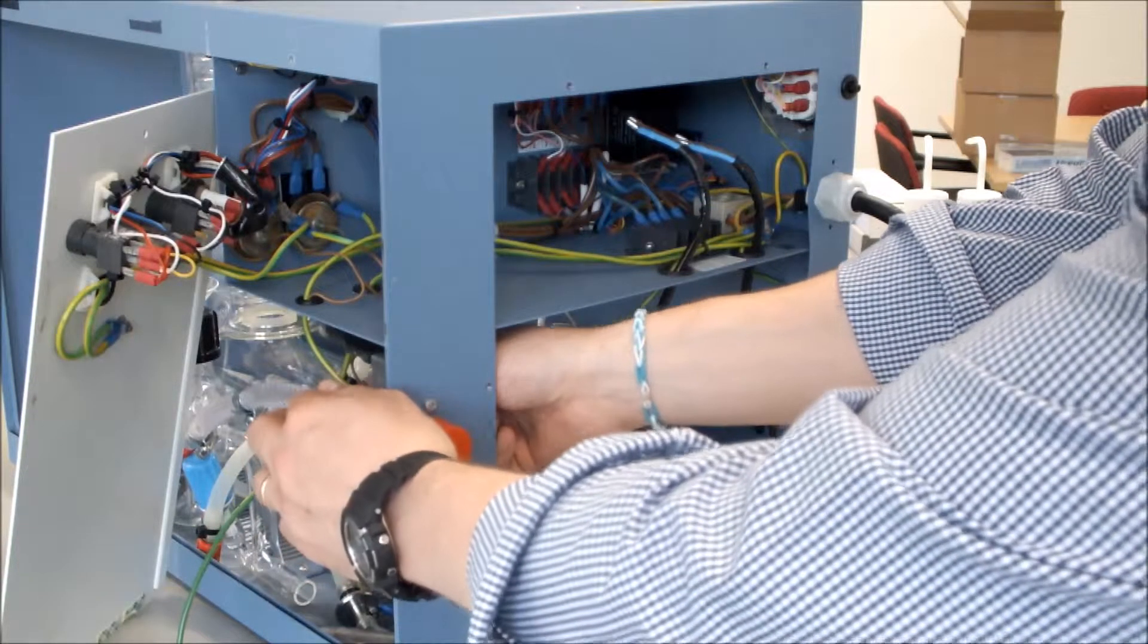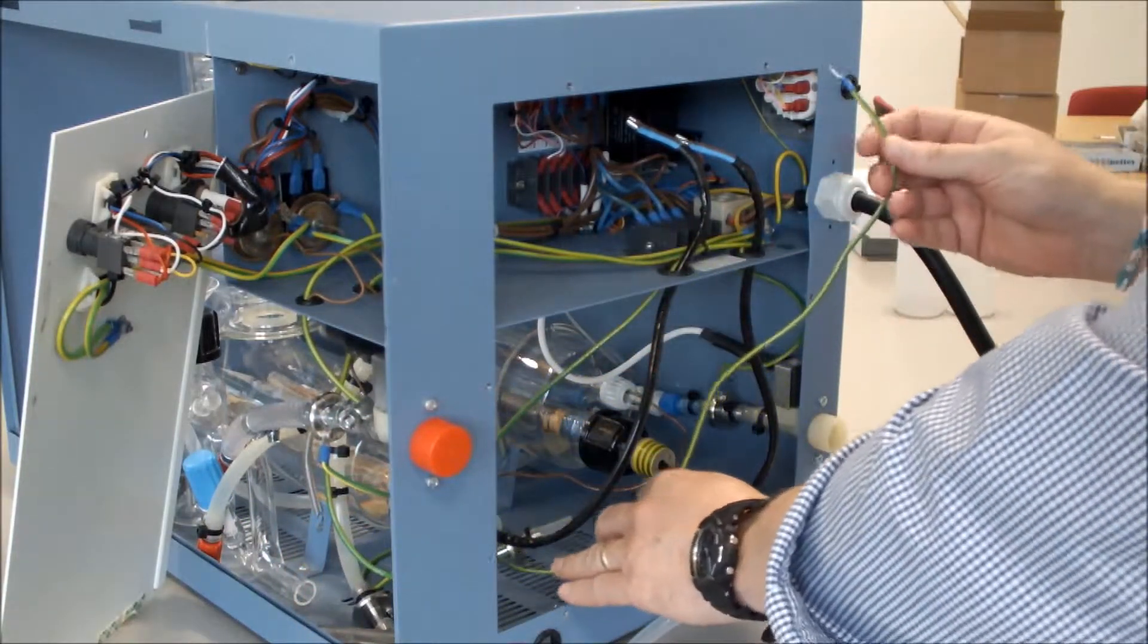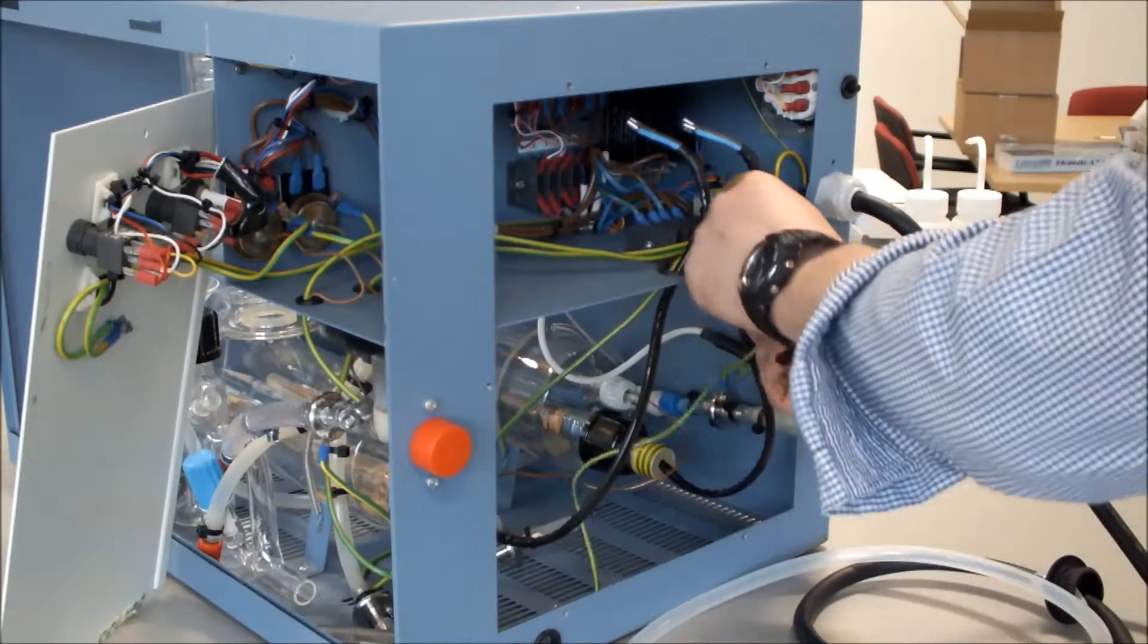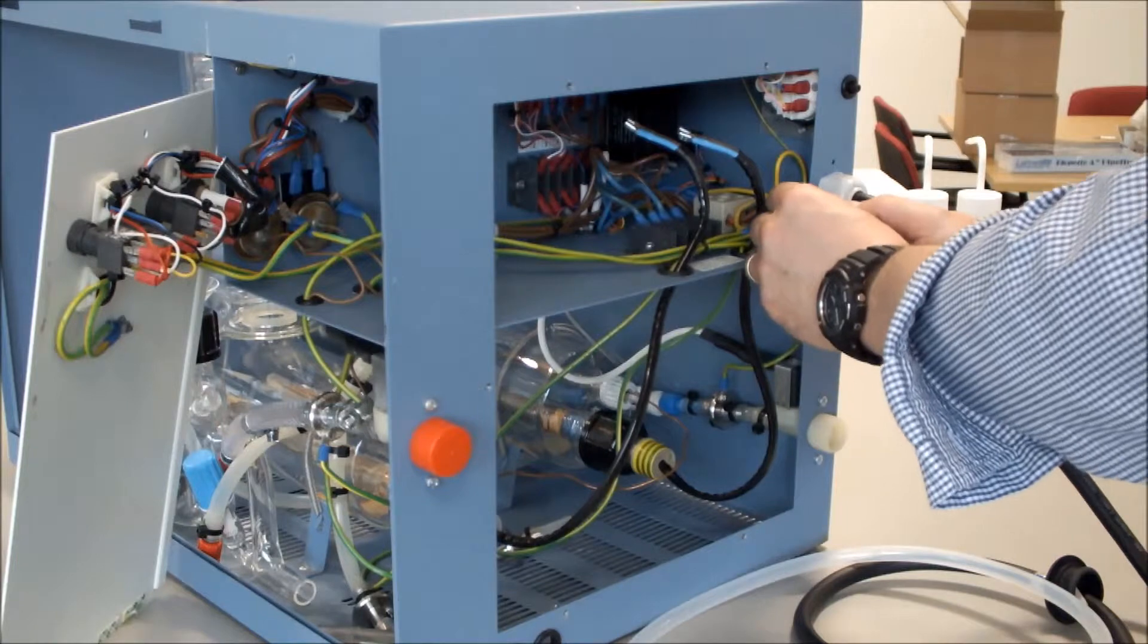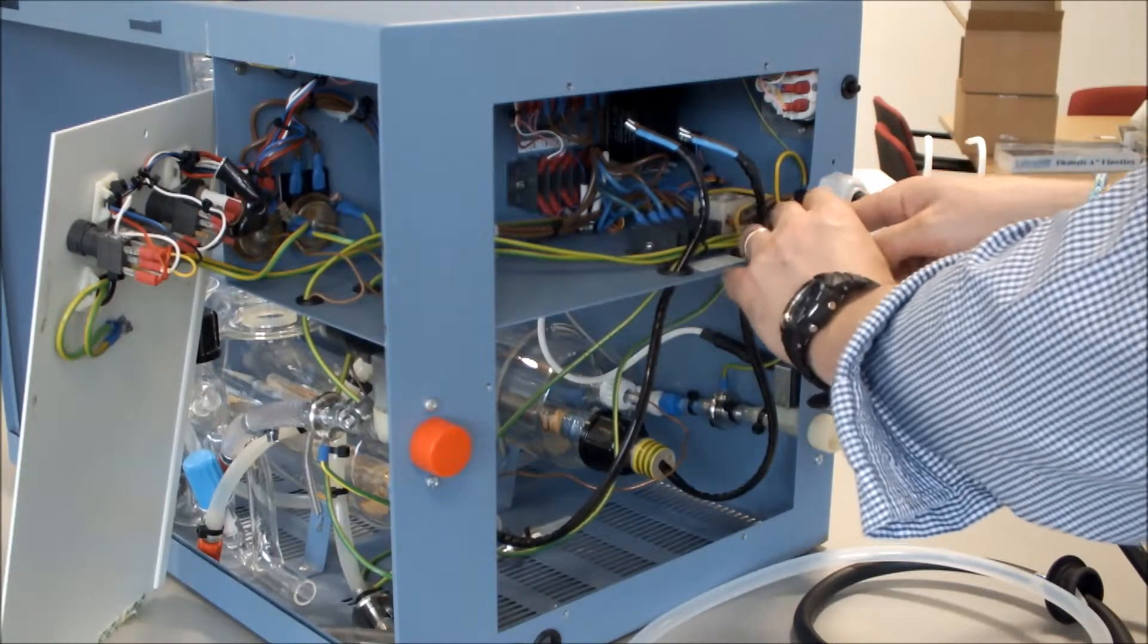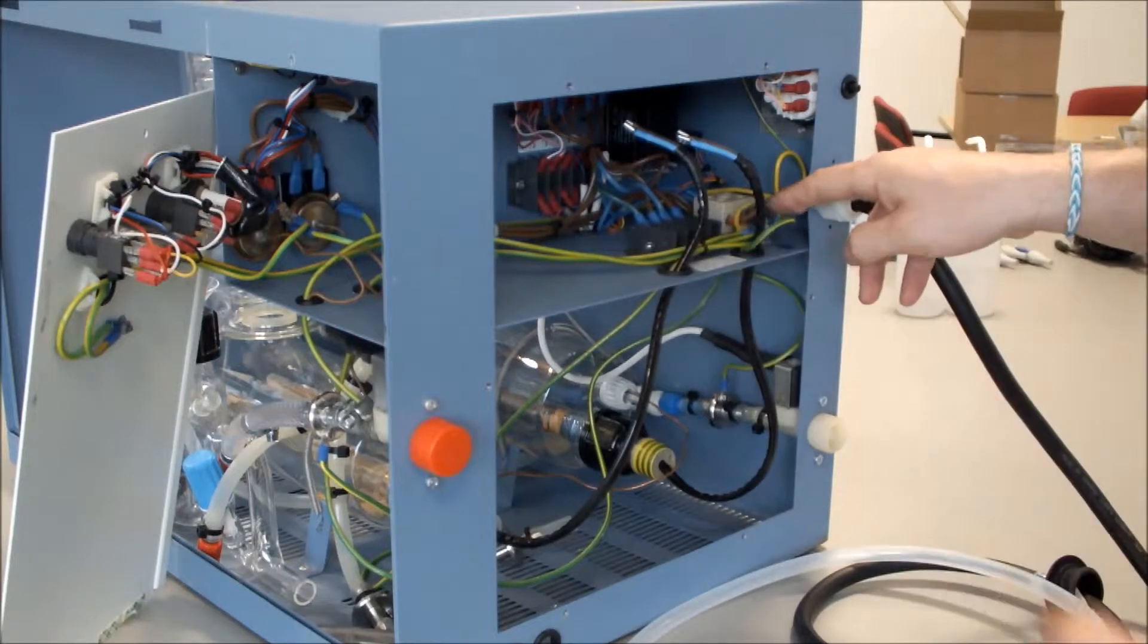From our deioniser pipe assembly, we then take our earth cable, feed it through the hole in the chassis, and connect it to the earth point. Undo the nut, fit the earth cable, put the nut back on, and tighten it up.